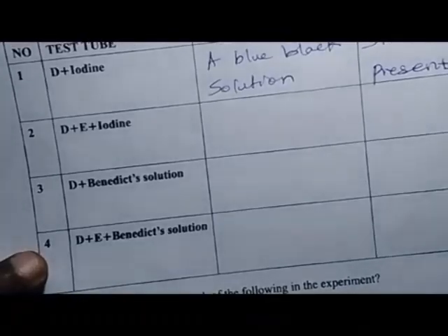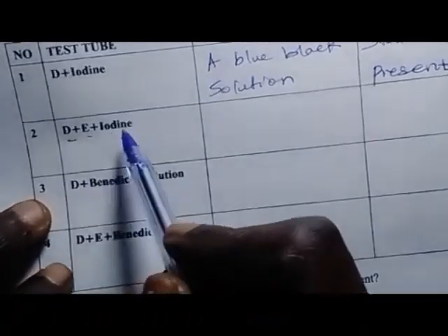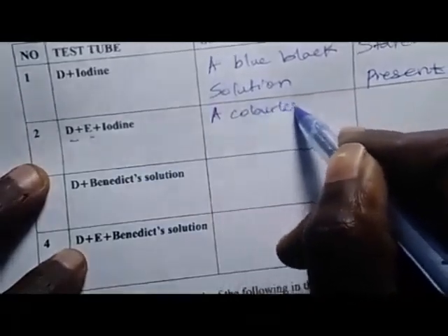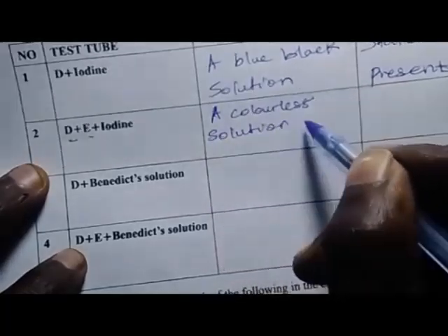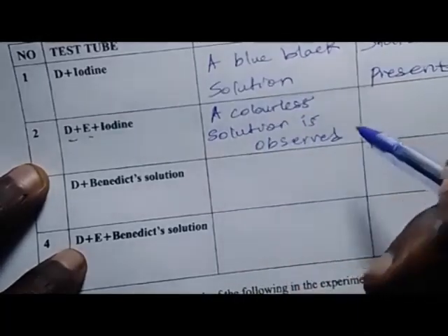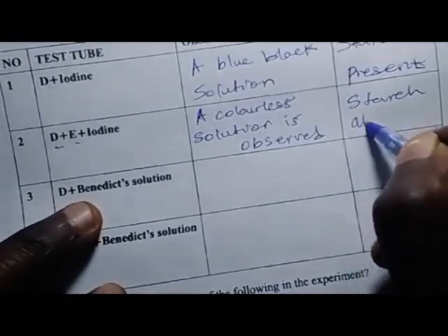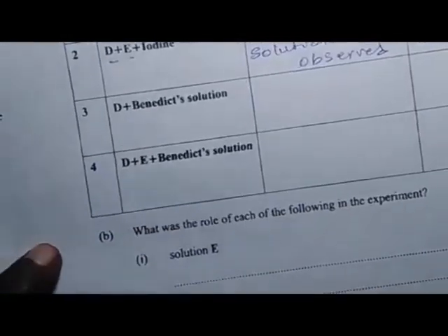Tube 2, as we are told, you put solution D and E and iodine solution. Now your observation should be that a colorless solution is observed. This simply means that the starch was absent.